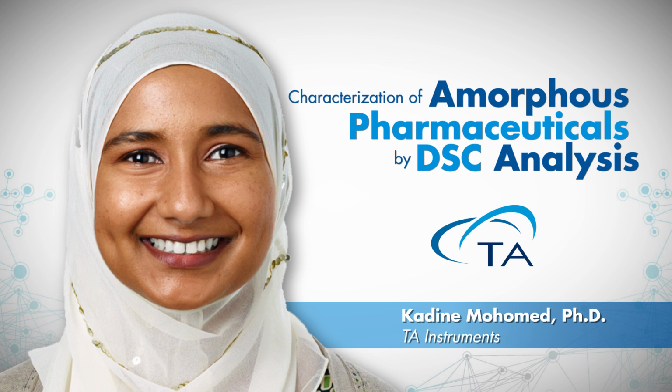And from that partial area analysis, you can generate, from the Van 't Hoff equation, an Arrhenius relationship. And from that Arrhenius relationship, the slope and the intercept can give you information such as what is your impurity level, as well as the expected melt point with this impurity. So the answer to that question is yes. It's really well defined in the ASTM standard.